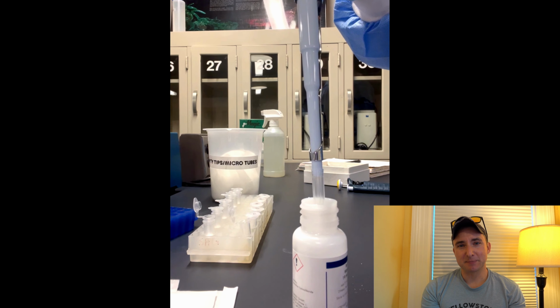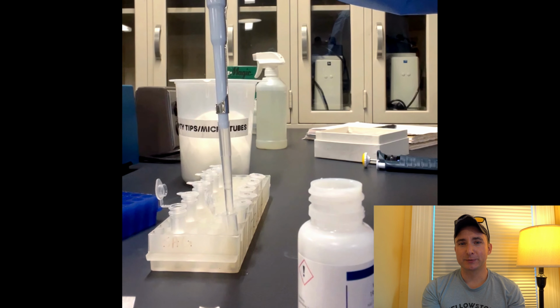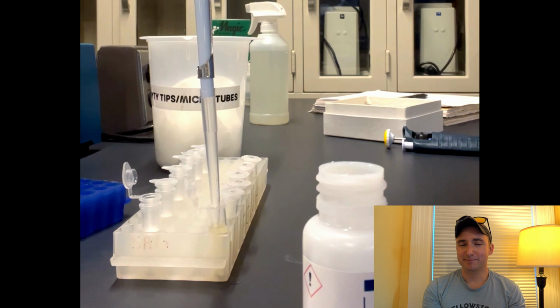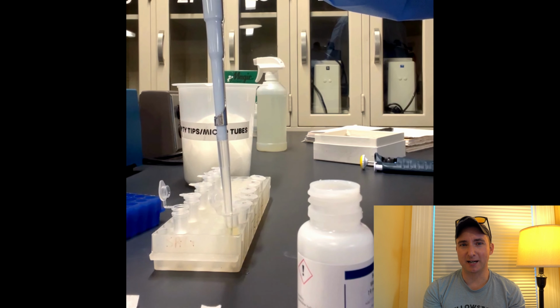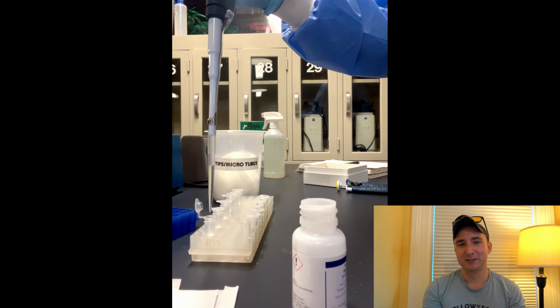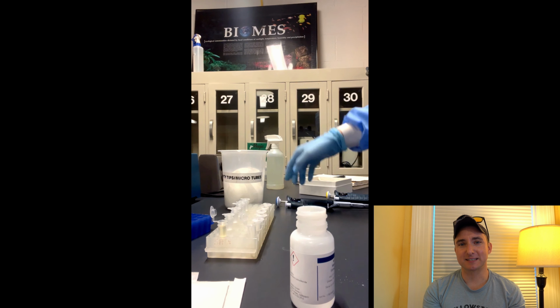Rather than pipetting up and down slowly, carefully, you see them go pop, pop, pop, pop. They're moving the pipette in ways that they wouldn't normally. The right way to mix by pipetting is to keep good pipette technique, drawing that liquid up gradually, slowly, carefully, and expelling it smoothly, and doing that maybe 3 to 5 times. Not just once. When people rush, I see them do it just once, up and down, really quick. And again, not an awkwardly uncomfortable, very high number of mixes. You just want to do a good, smooth 3 to 5 mixes with a pipette.